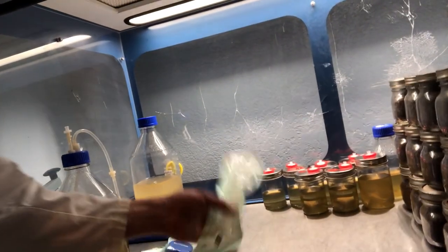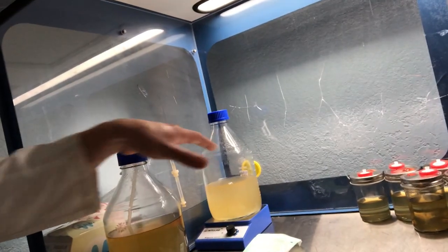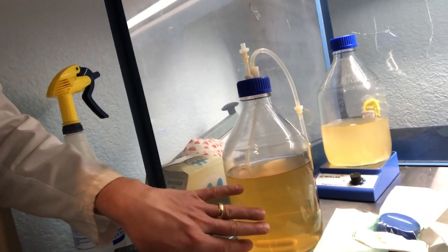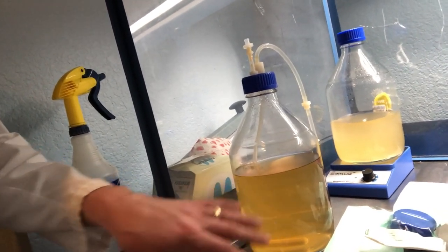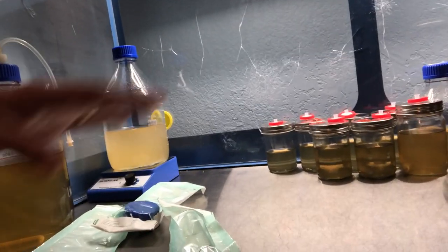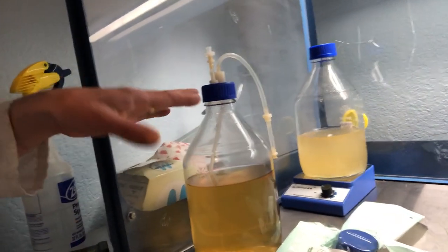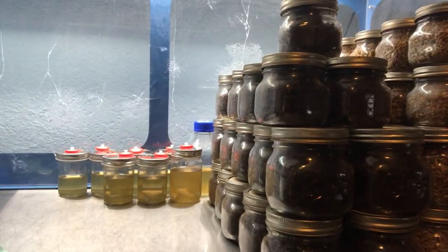But I'm going to go over how to use this Luer lock pipette in combination with the media extractor. I also produced a lot more liquid culture for the Cordyceps. I'm going to be giving this another try since my previous inoculation was contaminated. I cleaned this out thoroughly and produced a lot more liquid cultures that I'm going to be doing today as well. But my main focus right now is to show you how to use this media extraction device. So I'll flip this camera around and go through how to inoculate a bunch of these sawdust spawn jars.